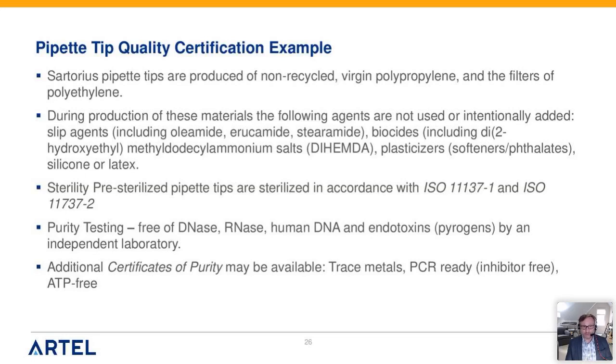They'll say that they don't use mold slip agents and what type of polypropylene is used, and they'll describe all of that. And sometimes they'll do purity testing if you're working on manufacturing QC and you don't want endotoxins or RNases and DNases. So, you can get these quality certifications, but there aren't necessarily anything that deals with the performance of the tip.